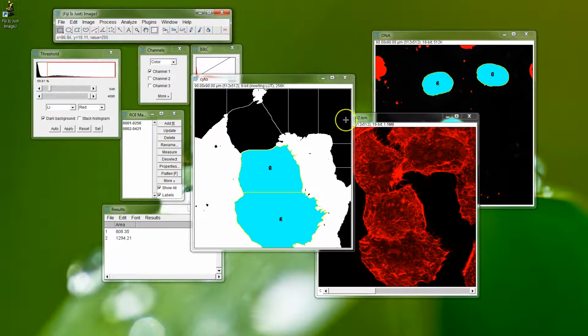Right, now we're starting to get to the regime where we're including what we want here, but we're missing out something we want here. So we're not able to distinguish between these two, which are similar size. So this is where it starts to sort of break down, and I don't seem to get on too well with Fiji, but it does work for some easily separable cells.